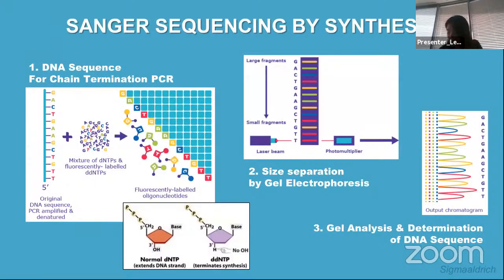The founding methods in DNA sequencing were the Sanger dideoxy synthesis and Maxam-Gilbert chemical cleavage. Since Sanger sequencing is introduced in a more standard way than Maxam-Gilbert chemical cleavage, I will focus on Sanger sequencing here as well.